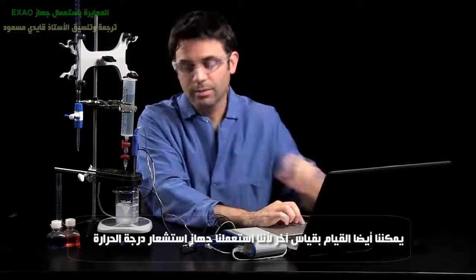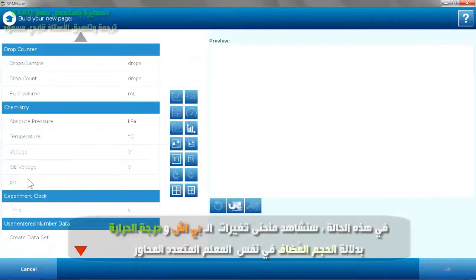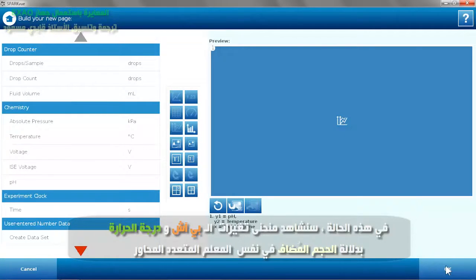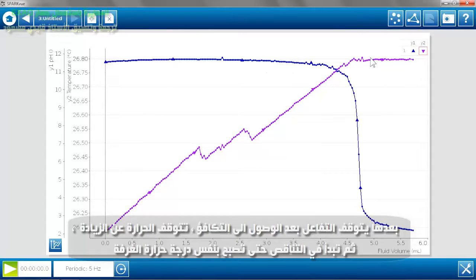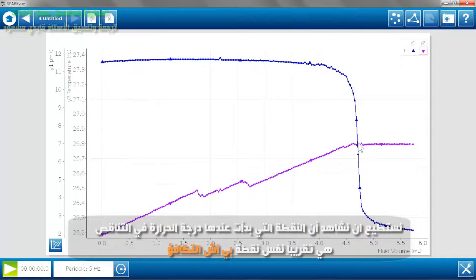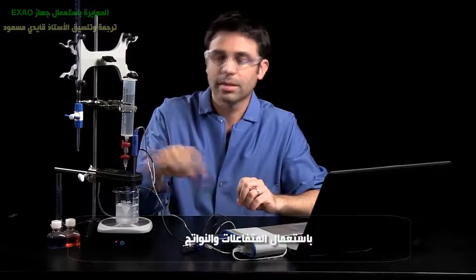I can go even further because I had the stainless steel temperature probe in there. I'm going to plot pH and temperature versus fluid volume using the multiple y-axis feature. Here we see the temperature steadily increasing as the reaction happened, and once the reaction stopped because the equivalence point was reached, the temperature leveled off and would eventually cool back down to room temperature. That point where the temperature started leveling off is approximately the same as the pH equivalence point, giving us a real understanding of the system happening in the beaker.